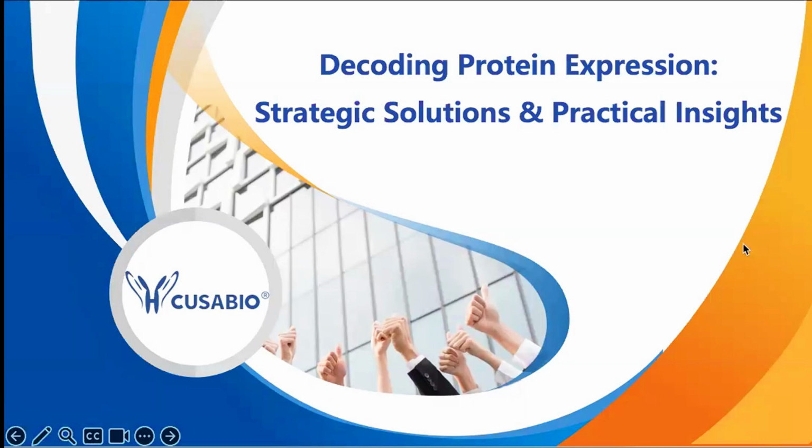So welcome back to our webinar. Today we will talk about recombinant protein expression, and we will talk about the key challenges during the process and how we can solve the problems.